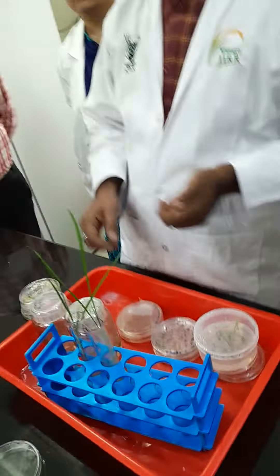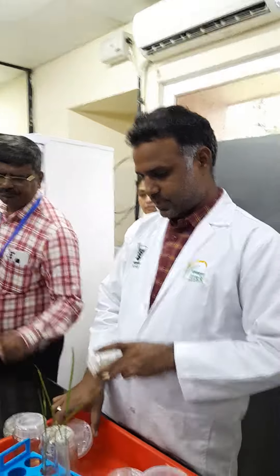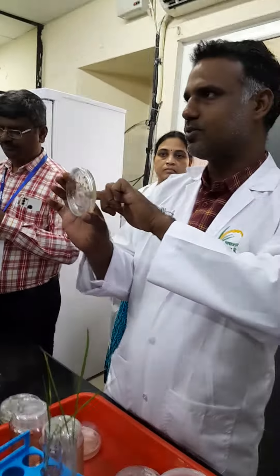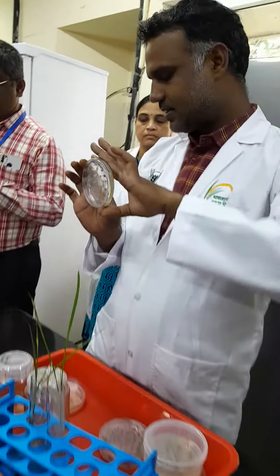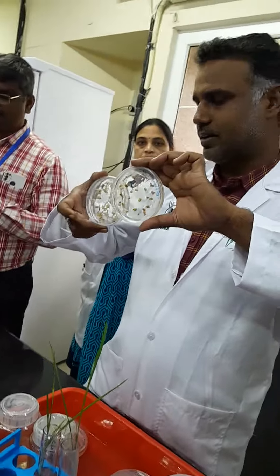Then after co-cultivation, on selection — suppose this is the first selection — it will look like this. A little bit of darkness has started. They are going to die. So initially it was like this, clear milky type. Now they are becoming browning and all.